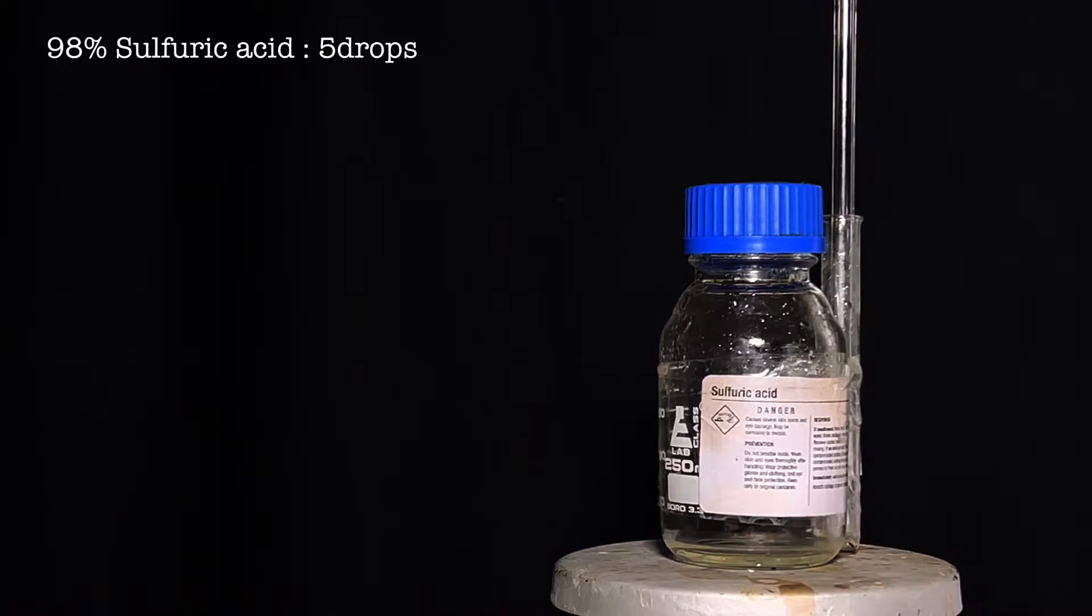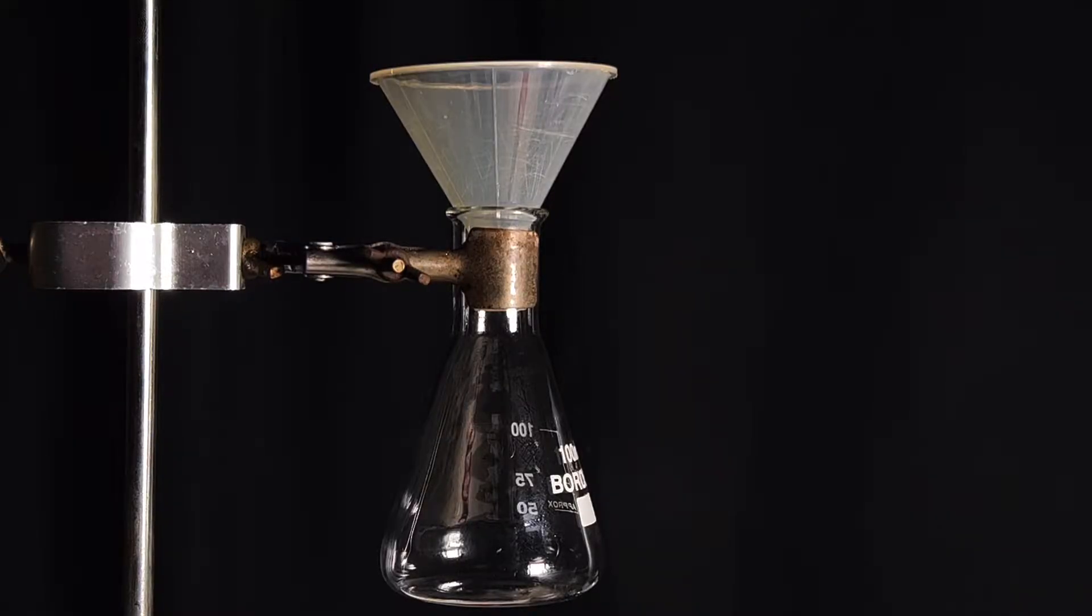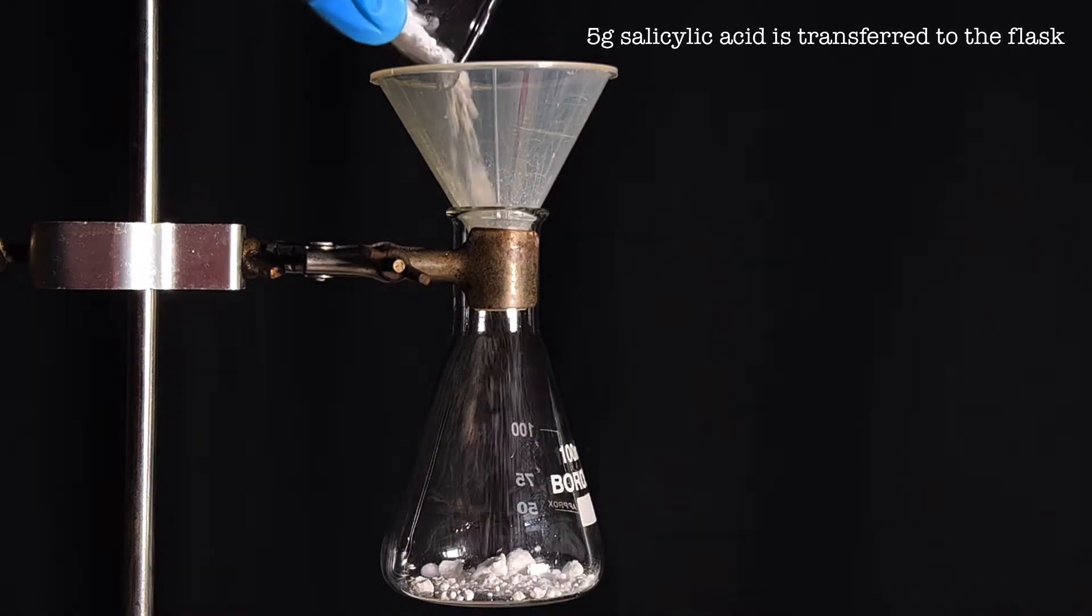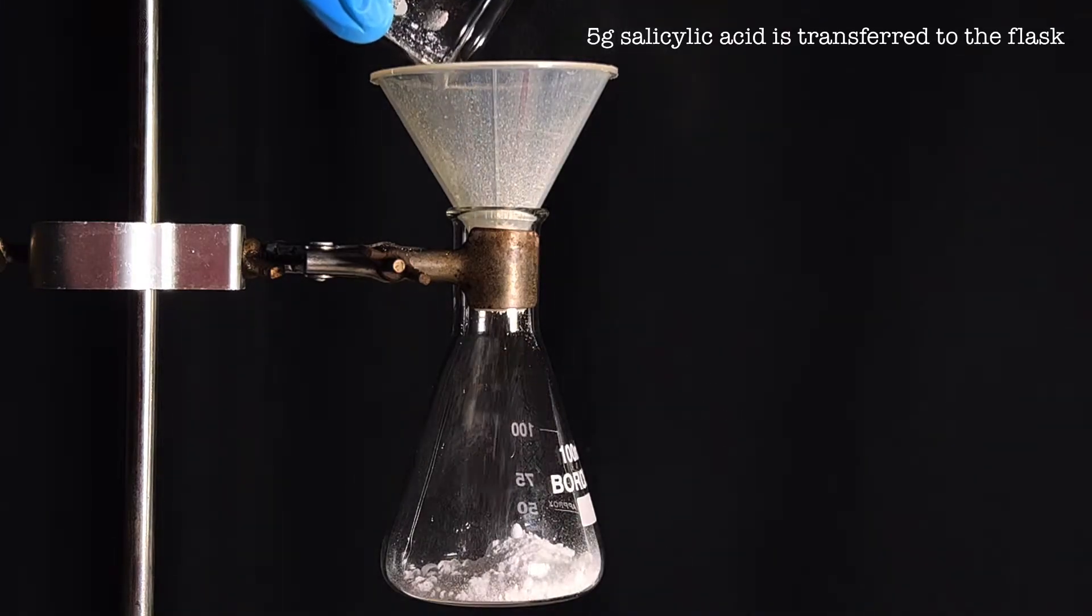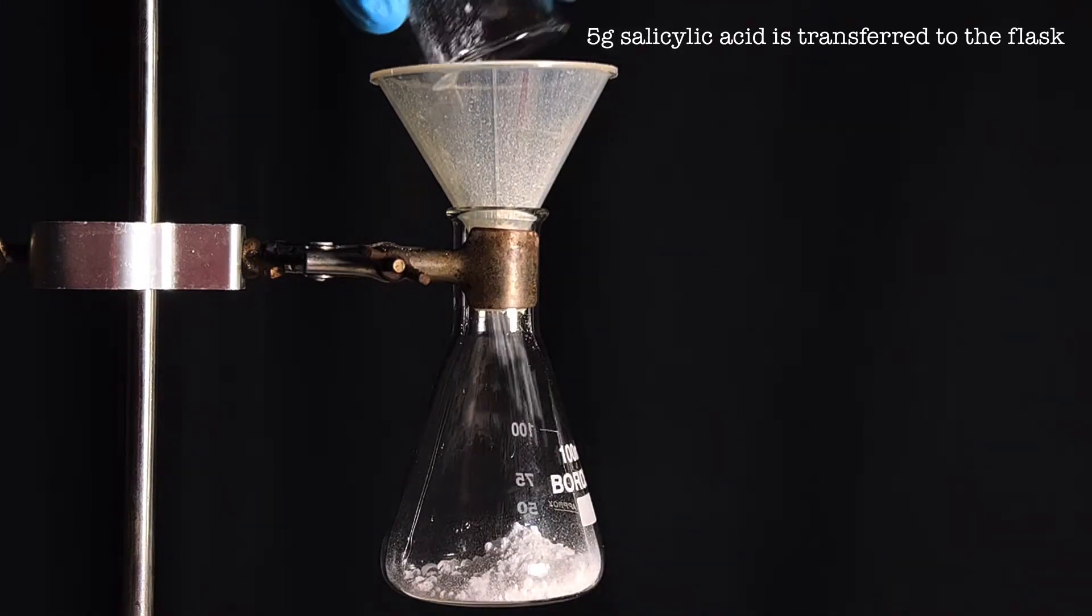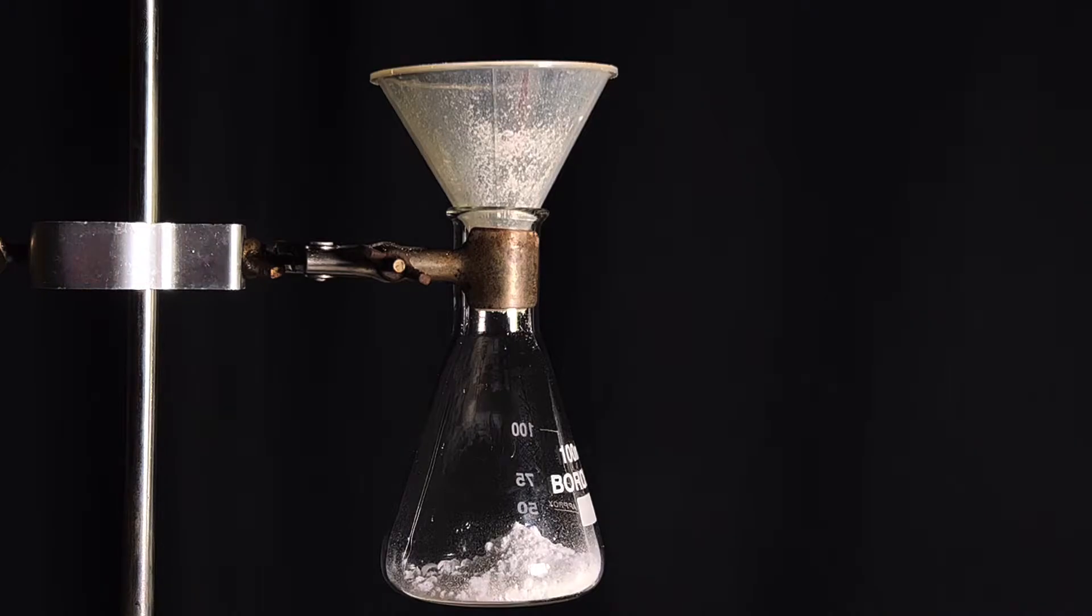Start by fixing a 100 milliliter Erlenmeyer flask on a stand via a clamp. 5 grams of salicylic acid was transferred to the flask using a powder funnel to prevent spillage.